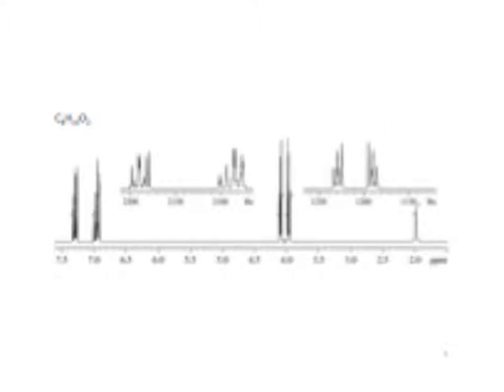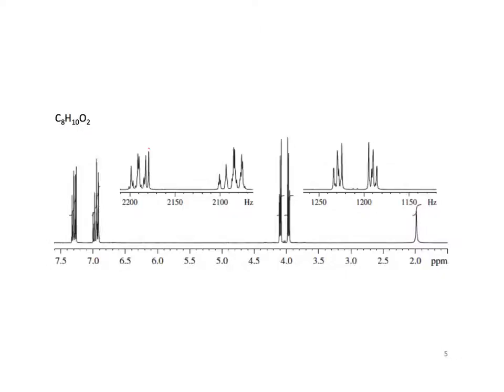All right, here's another one. This little peak right here on the side is the solvent, 7.26, something like that, because it's over here.